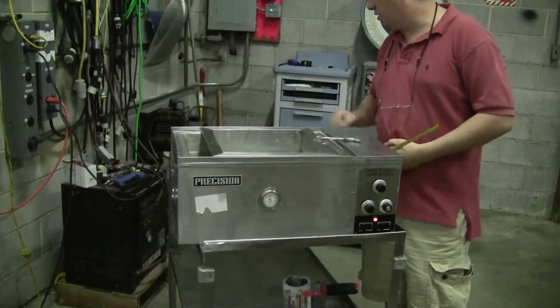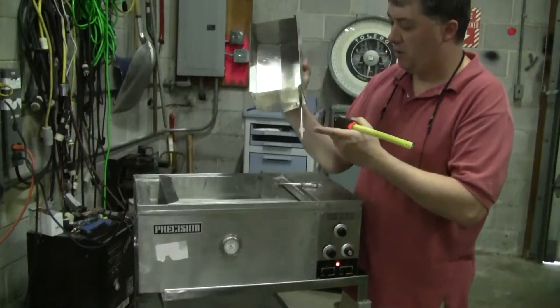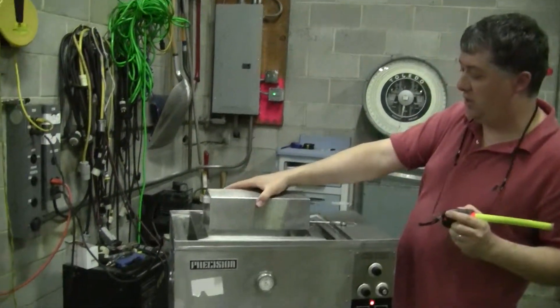This particular unit comes with this nifty little cover where they were either blanketing the samples or venting the samples — all stainless steel.